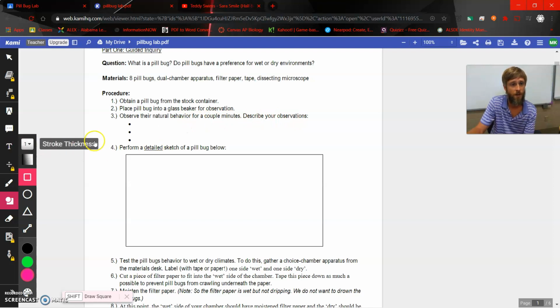Anyways, describe your observations. Come over here, click text box, insert 3 text boxes, and type in some observations that you make. Could be physical observations or observations about how it looks like it's behaving. I did knock it upside down one time, now that I think about it, to give you a view of what it looks like on the underside. But remember that this investigation is to study animal behavior, so maybe that could lead you through the observations you make. This is within the first steps of the scientific method. We have to make educated hypotheses, and therefore we need observations.